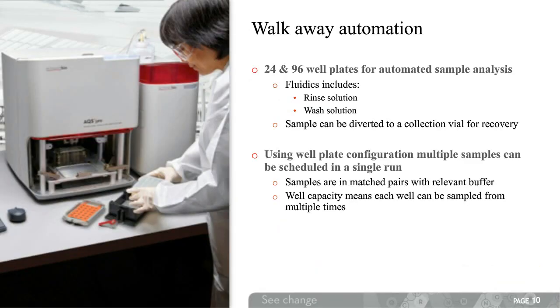In order to run our samples, we would simply pipette solutions of sample and then the matched buffer into wells adjacent to one another on either 24 or 96 well plates, in order to run a large number of samples in an automated fashion, either during the daytime whilst you're present within the laboratory, or if you wish, you can load them to run overnight and have all of your data analysis ready for you in the morning.